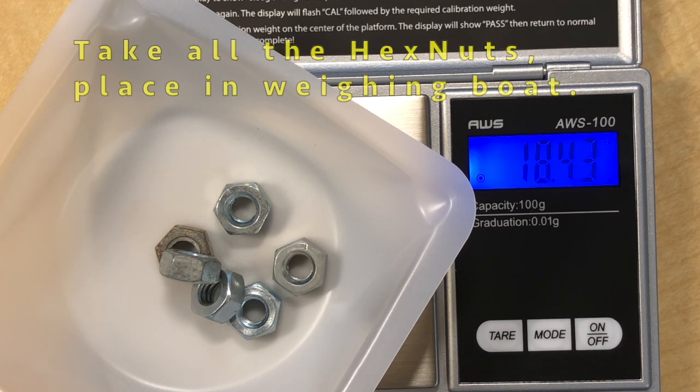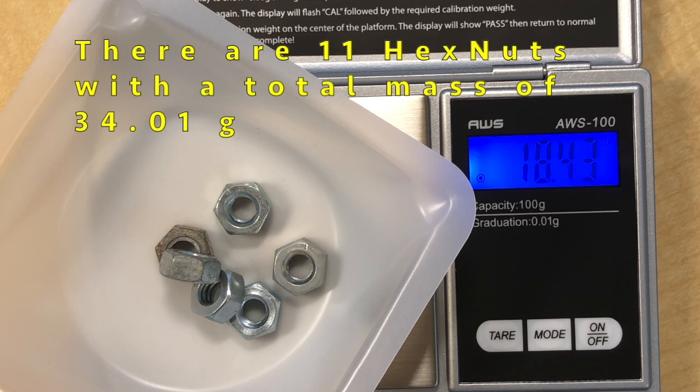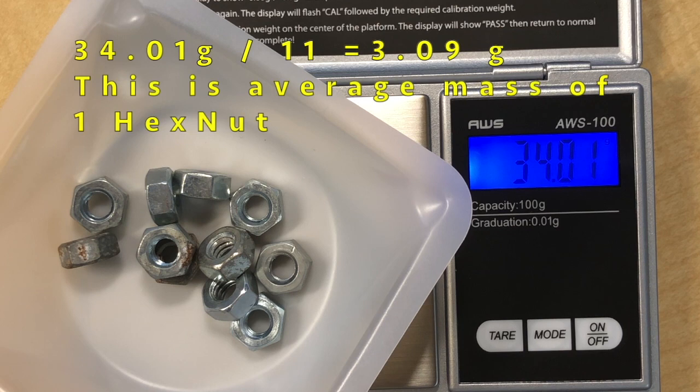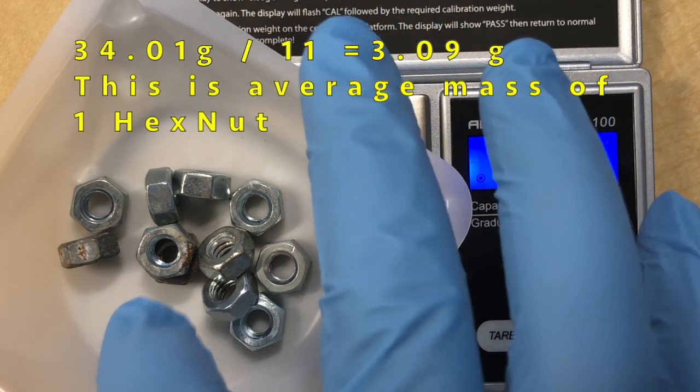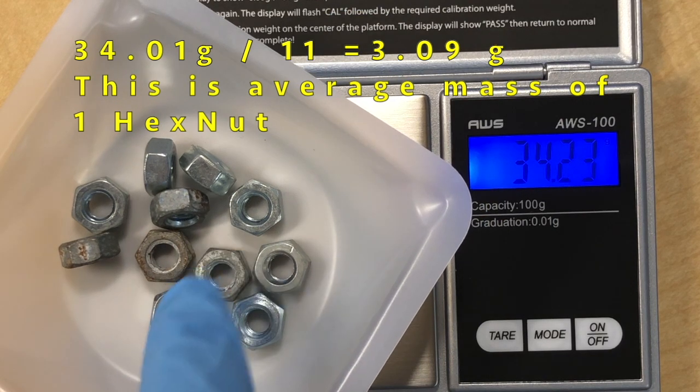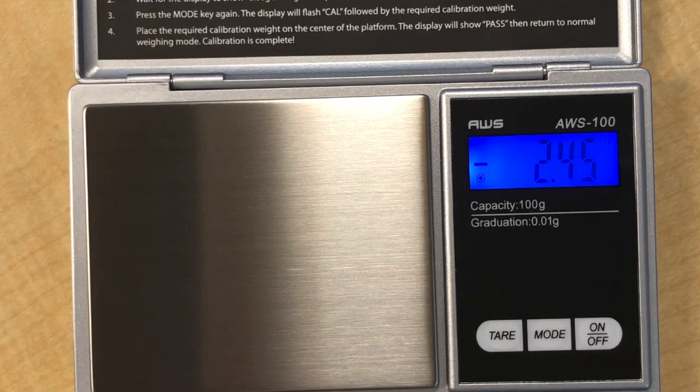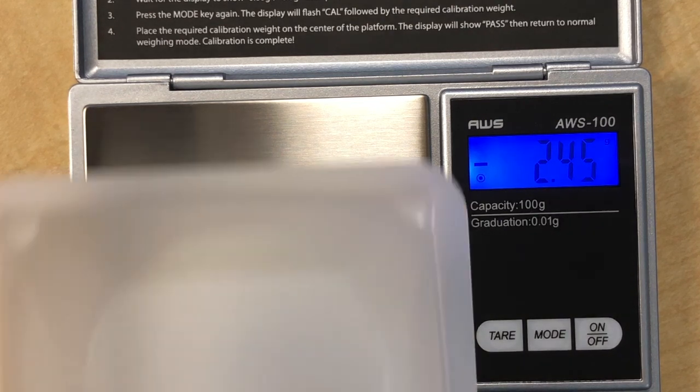In this particular case the total mass is 34.01 grams. There is a total of 11 nuts, so 34.01 grams divided by 11 means each nut weighs an average of 3.09 grams.